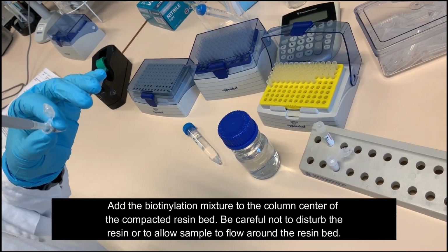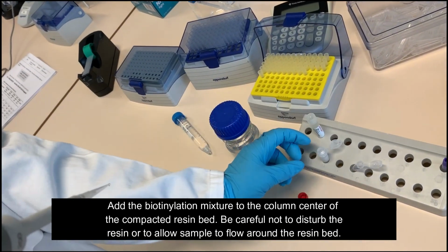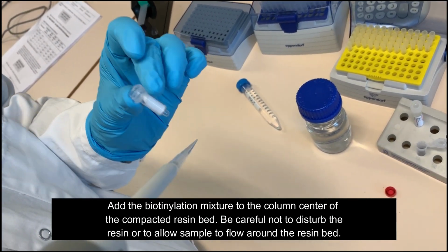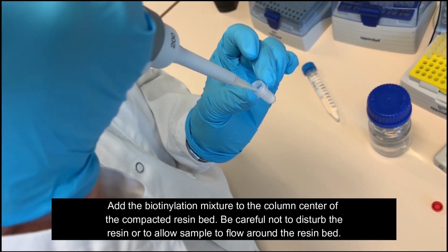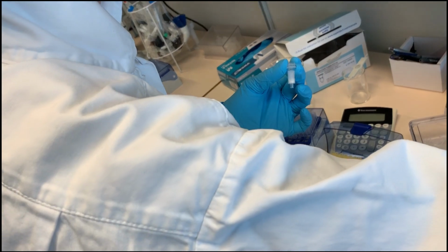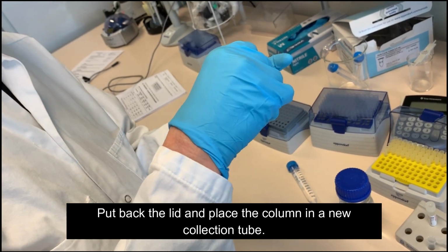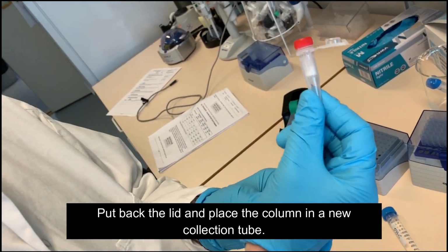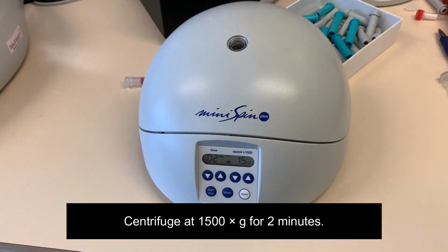Add the biotinylation mixture to the column and make sure you add it in the center of the compacted resin bed. Be careful not to disturb the resin or not to allow the sample to flow around the resin bed. Put back the lid and place the column in a new collection tube. Centrifuge again at 1500 G for 2 minutes.